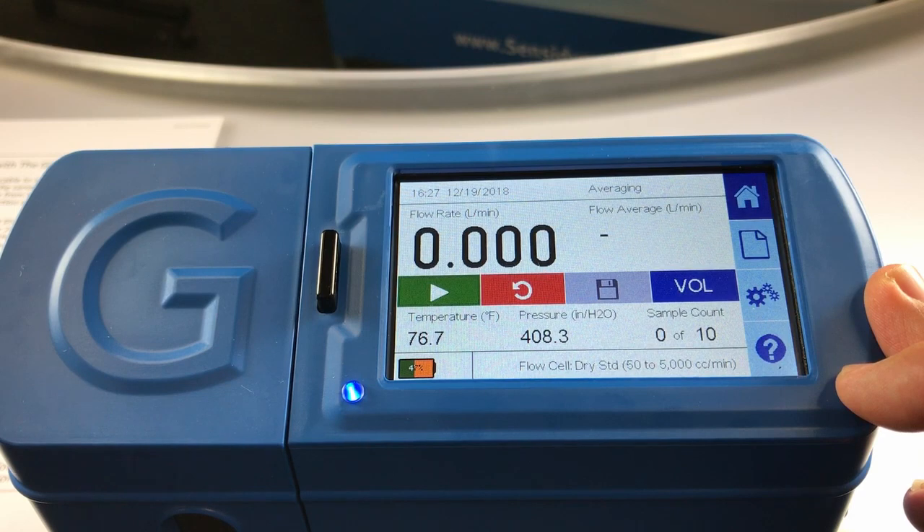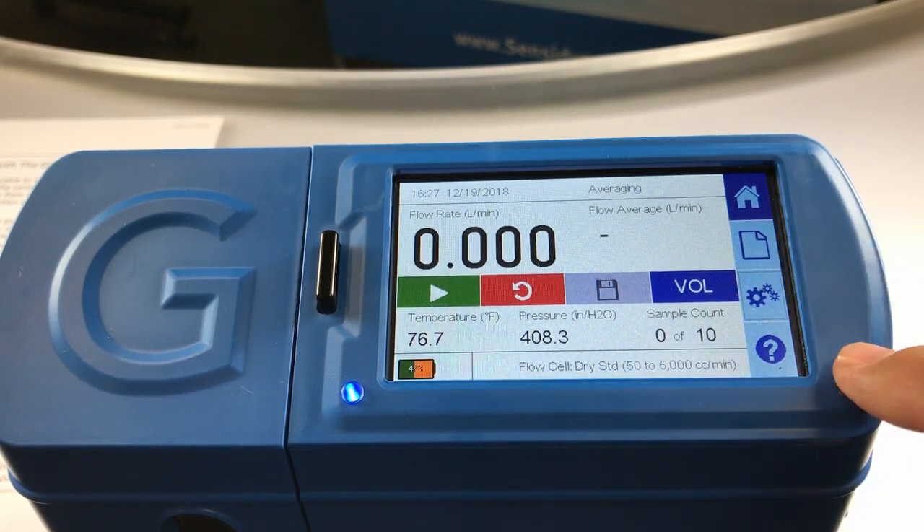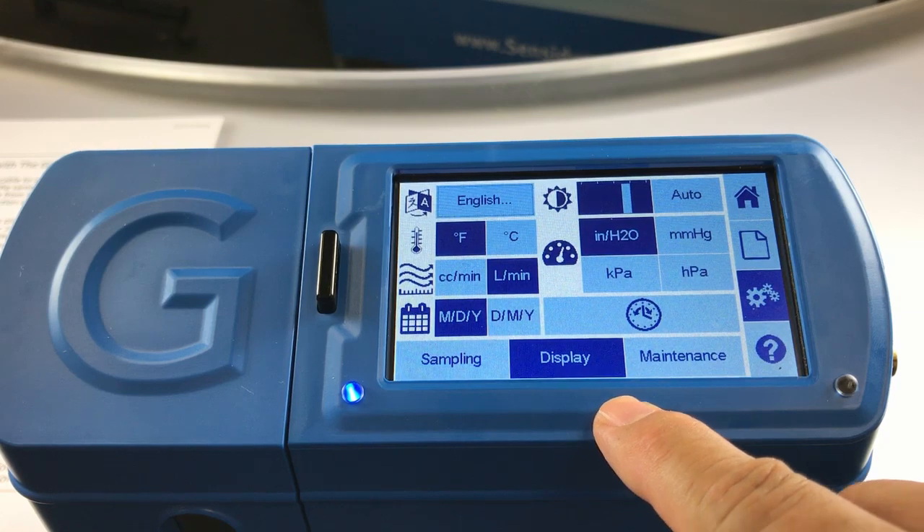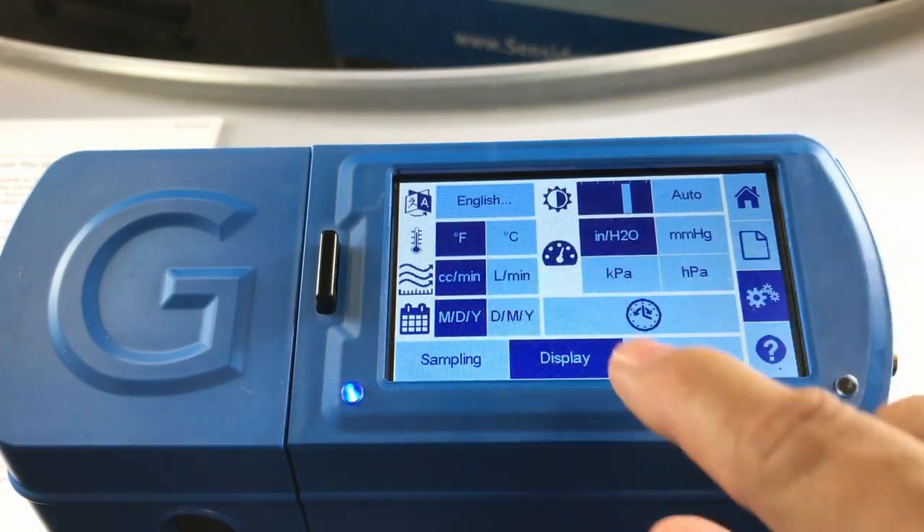In order to use the SmartCal feature, the flow units need to be set to cc's per minute on the Gillibrator 3. We'll do that by entering into the settings feature and clicking on the display tab. We'll change it from liters per minute to cc's per minute.